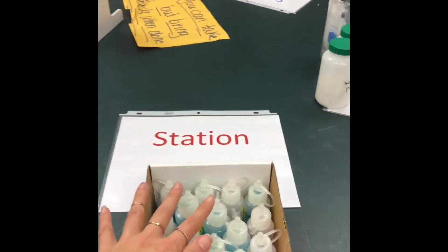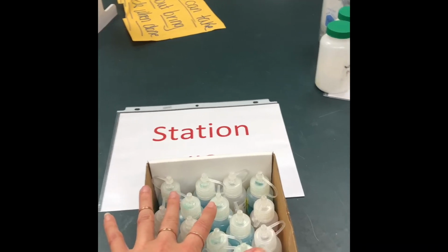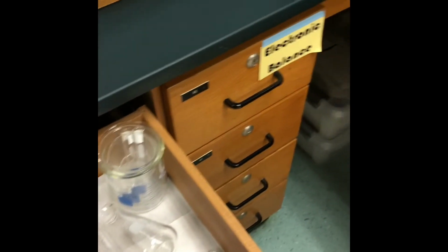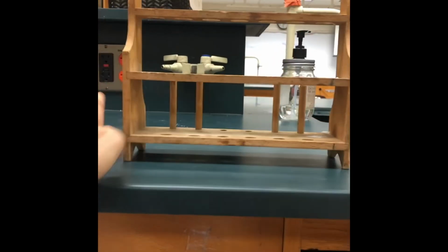Okay, so obviously you're not going to need all of them. Take what you need, and the rest are for other groups to use. And when you do use your own test tube, remember you have your own personal drawer to make sure your stuff is clean. Also remember that your other stuff that you need could be located down here in this cabinet, such as your test tube rack. Remember, a test tube goes in a test tube rack. It should not just be casually hanging out on your station because it can roll off and break.